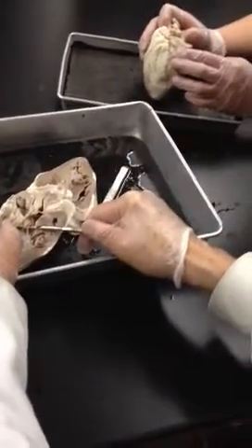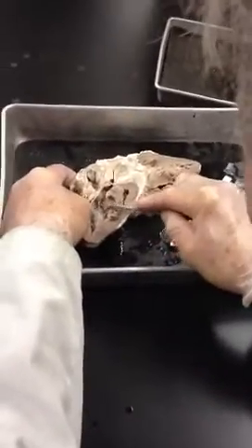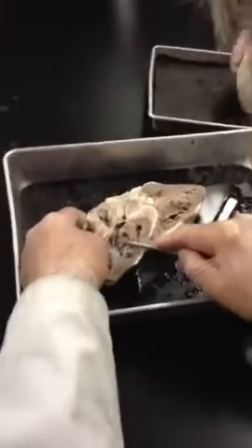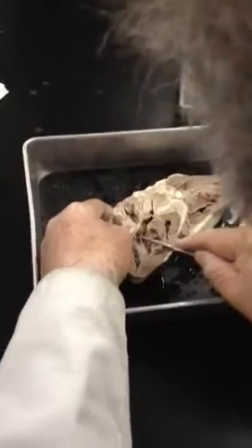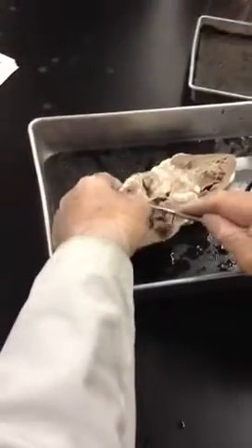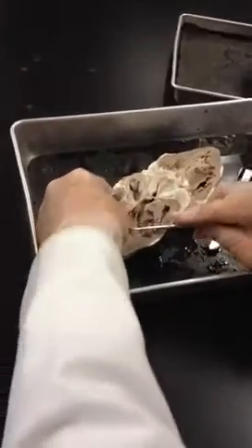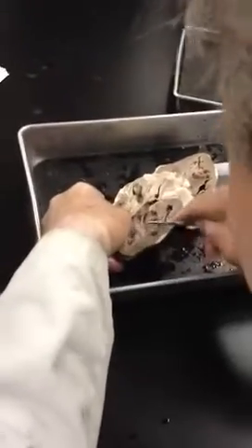These tendinous cords — that's number 20 — are attached to little muscles here called the papillary muscles. Just like a papilla sticks up, these are the papillary muscles. And this shininess that you're seeing is the endocardium — this shininess here is the endocardium.